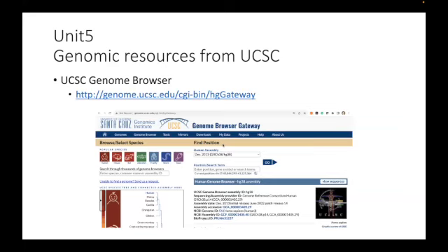So basically, we are going to repeat, but you want to familiarize yourself so that you can pull down the relevant information using the UCSC Genome Project. I was pretty surprised that UCSC happened to be the leader in this field for a long time. I was quite impressed by what they were doing.